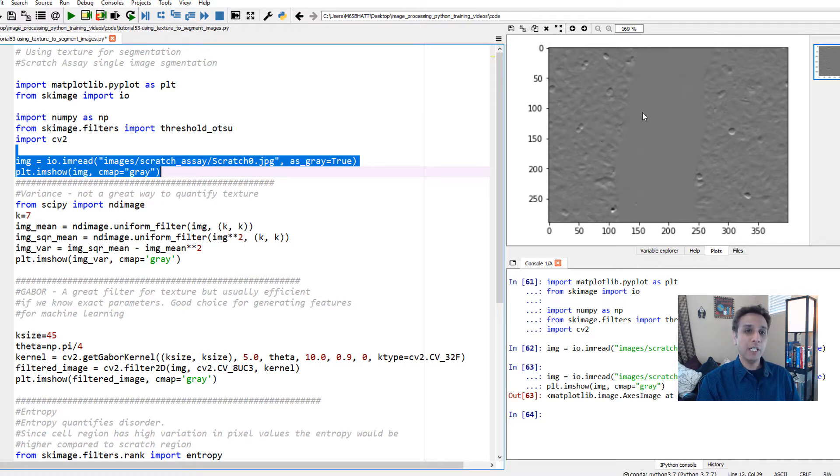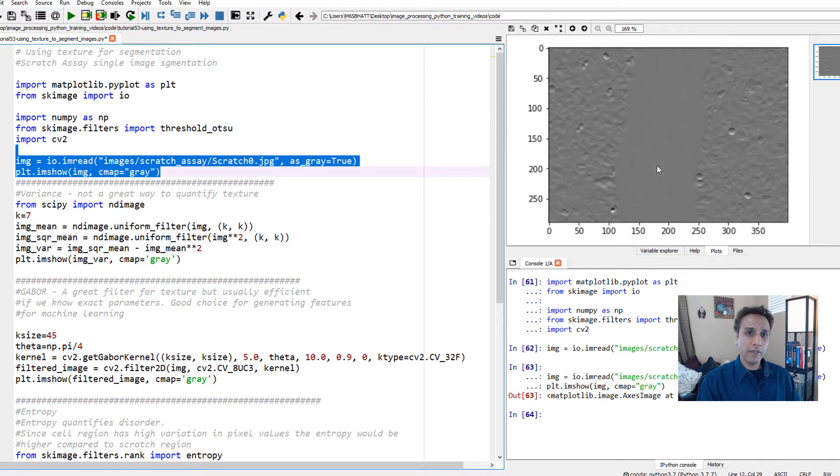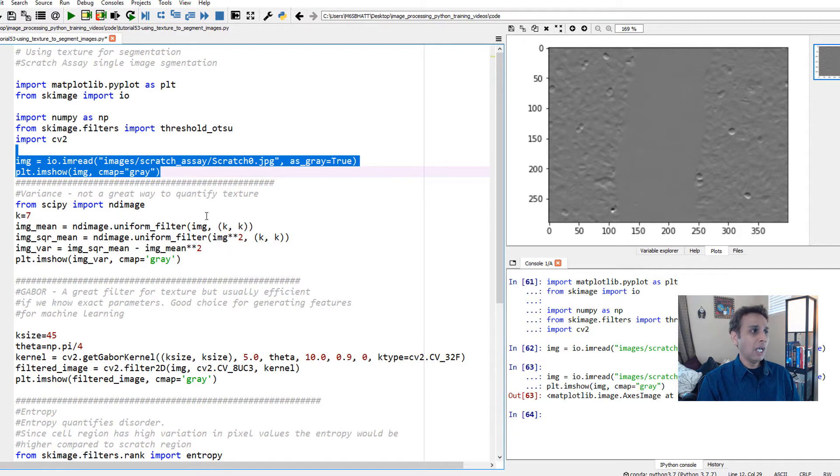Our goal is to separate the smooth region from the region where we have texture. We can calculate the area of this smooth region. In this application, we're trying to see the area of the smooth region compared to the textured region.